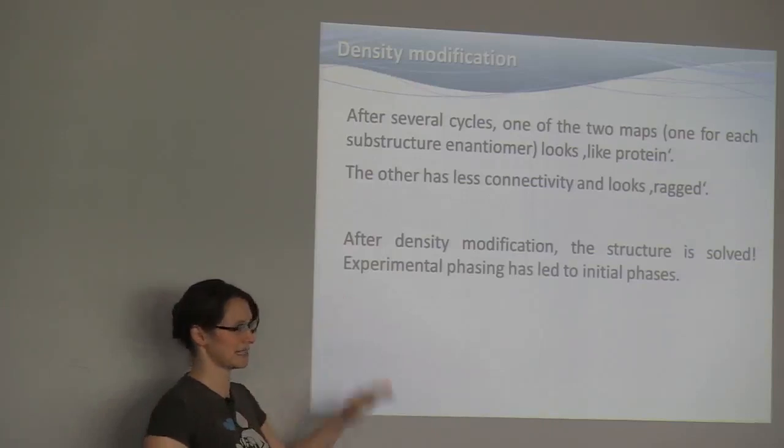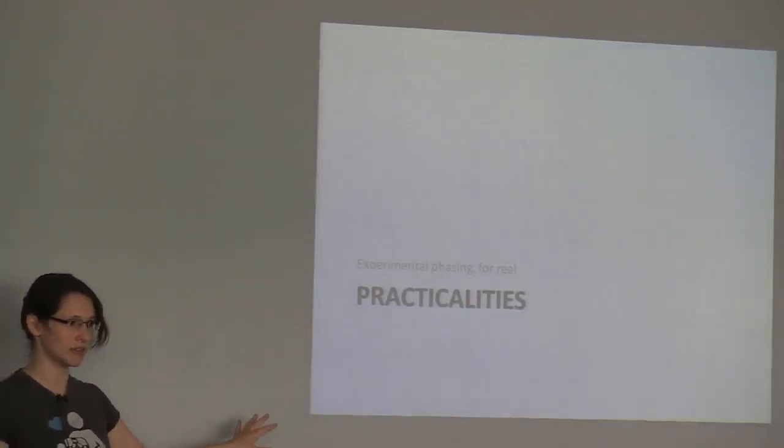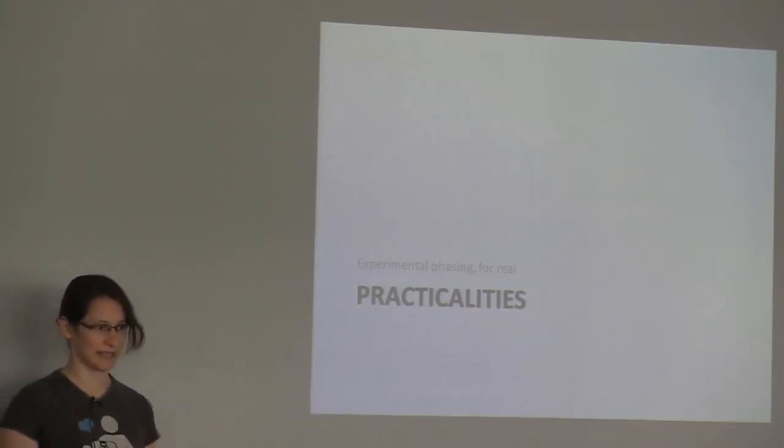Experimental phasing has led to the initial phases, and from there you can go on. I am not going to talk about ShelXE autotracing because I will talk about this in not the next lecture, but the lecture afterwards, rather extensively.